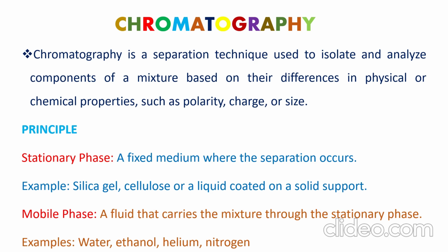Chromatography is a separation technique used to isolate and analyze components of a mixture based on their differences in physical or chemical properties such as polarity, charge, or size. It is an important biophysical technique that enables the separation, identification, and purification of the components of a mixture for qualitative and quantitative analysis.